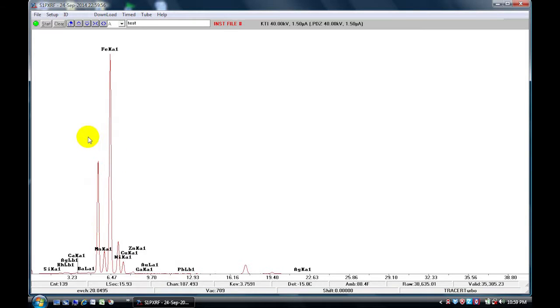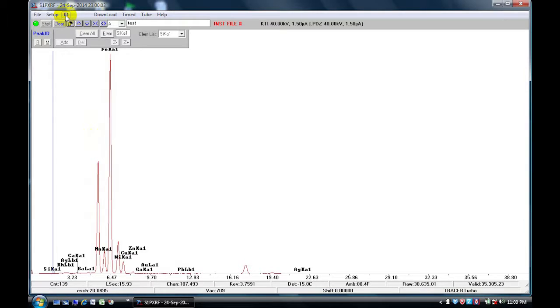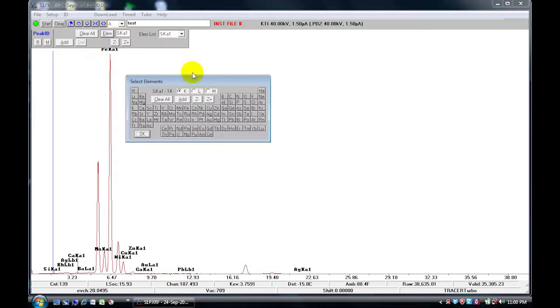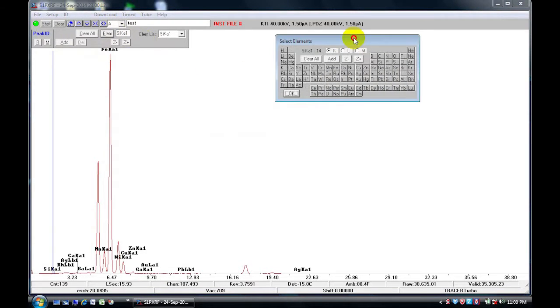The next step is to label your peaks. Go to your ID, and here you will have several options. If you click on elements, you will get the periodic table, and you can choose between the K lines, L lines, or M lines.